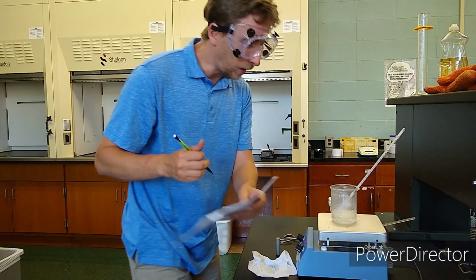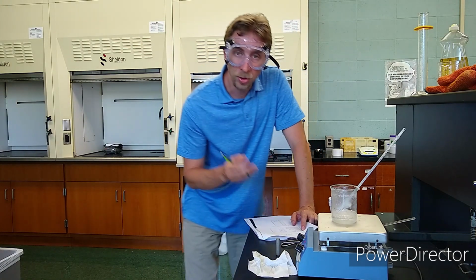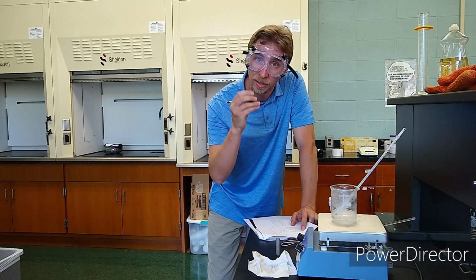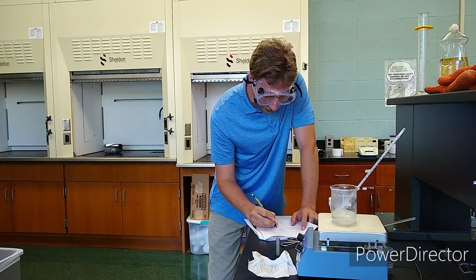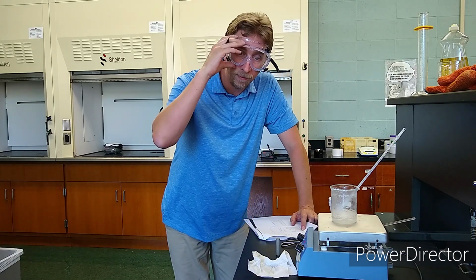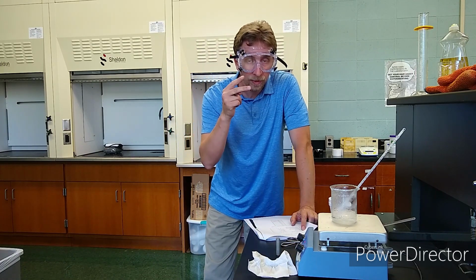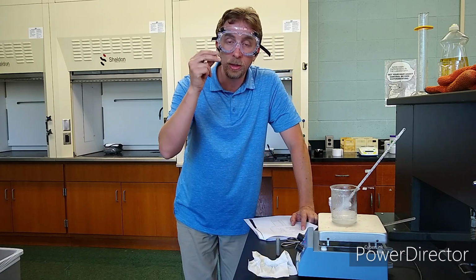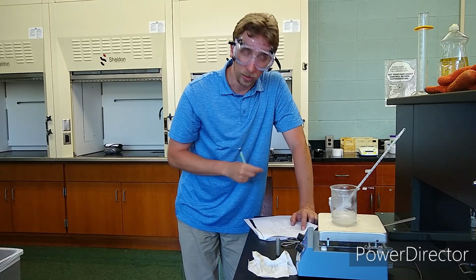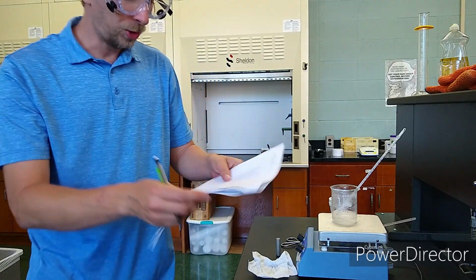Now you see why we needed to measure to the 10th place. If we didn't estimate that final temperature on the thermometer in between the smallest marks, we wouldn't have been able to get that 4.7 degrees Celsius temperature change of the water. We would have only had one significant figure for the water's temperature change. Okay? We need two significant figures for the change in temperature of the water so that we can get two significant figures in the specific heat of the metal whenever we go through all the calculations. So now we have two significant figures for the temperature change of that water.